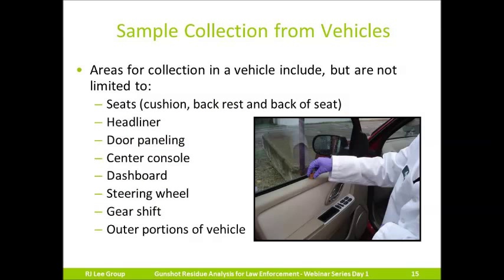So now I'm going to go over sample collection from vehicles. Vehicles are another common area for GSR samples to be collected from, obviously depending on the nature of the case at hand. The same method of particle extraction is utilized on the vehicle as is utilized on hands and clothing. Potential areas to sample from include, but are not limited to, let's say the seats, headliners, door paneling, consoles, dashboard, steering wheel. The list goes on.